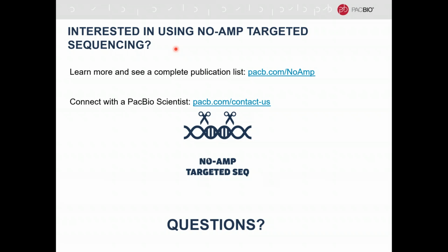If everybody's been following the gene editing area, CRISPR Cas9 and offshoots of that are incredibly efficient, as you showed in an example of some guide RNAs. Typically, when we've been working in collaboration with some of the early access customers, they design maybe a couple of guides on each end, and one of those is usually sufficient to move forward with the target enrichment approach. Is that reasonable, Jenny?